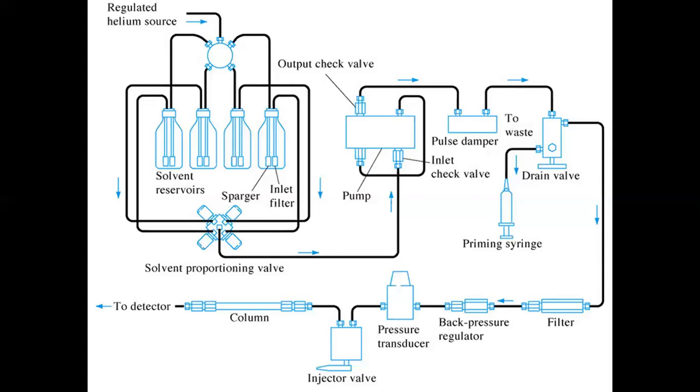So you can state the principle of high pressure liquid chromatography or high performance liquid chromatography. The principle can be stated as: it is a liquid chromatographic technique in which the solutes are separated by creating a pressure in order to increase the flow, and the separation takes place either by adsorption, ion exchange equilibrium, partitioning, size exclusion, or with different affinities.